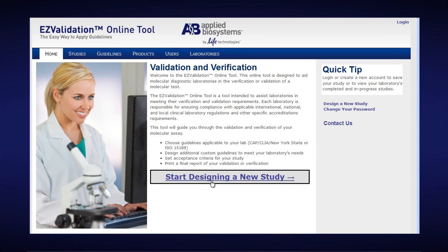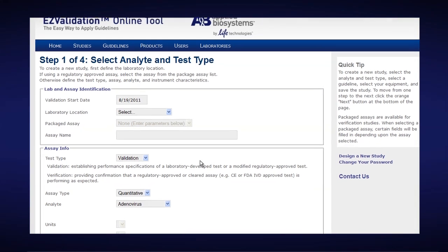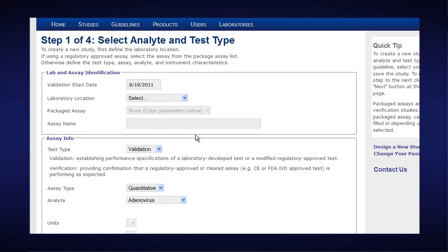First click on the Start designing a new study button. We have four steps. The first is to fill out the lab and assay identification and the initial assay information.